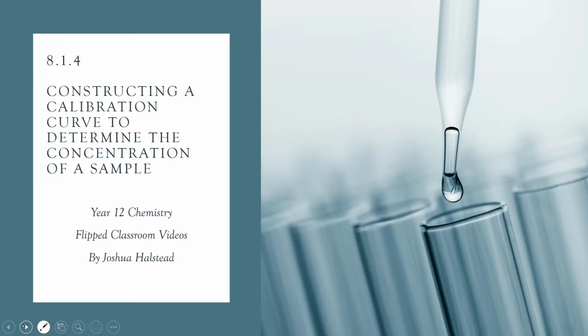G'day chemistry students, in this video we're looking at dot point 8.1.4. Our aim is to look at the steps required to make a calibration curve in a school lab and figure out the concentration of a contaminant in an unknown sample.